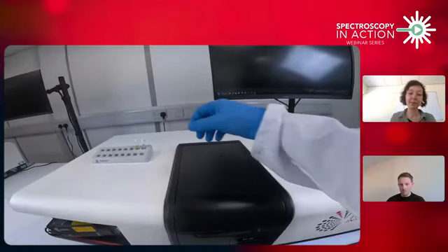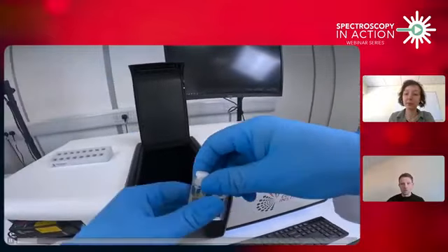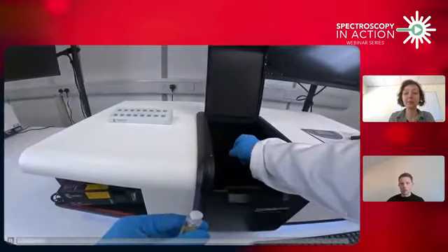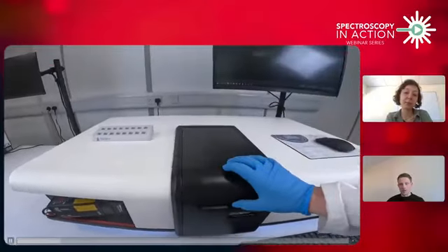Thank you, Maria. So in this experiment, I used two cuvettes. One was a solution of perovskite quantum dots, and the other was the pure cyclohexene solvent. So I start by putting both cuvettes into the SC-06 sample module.